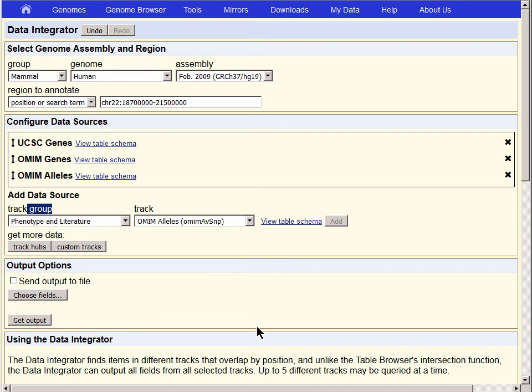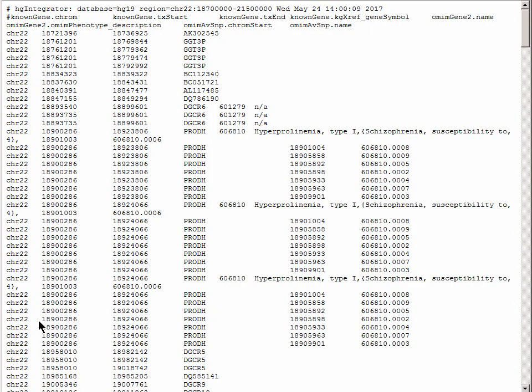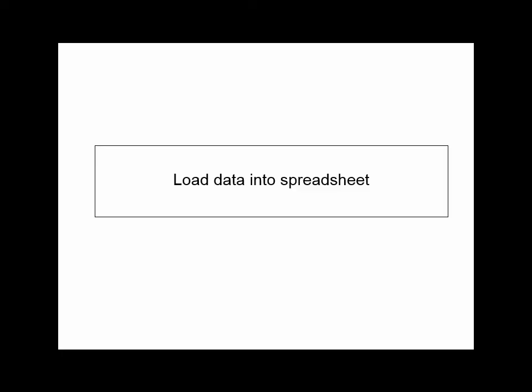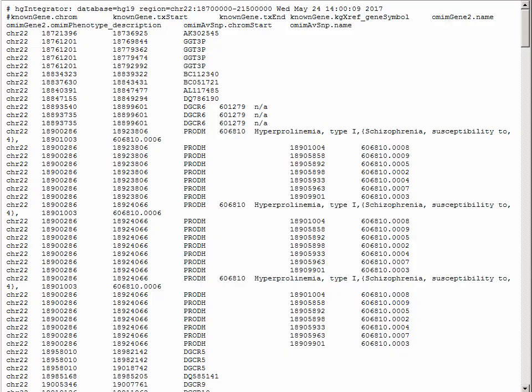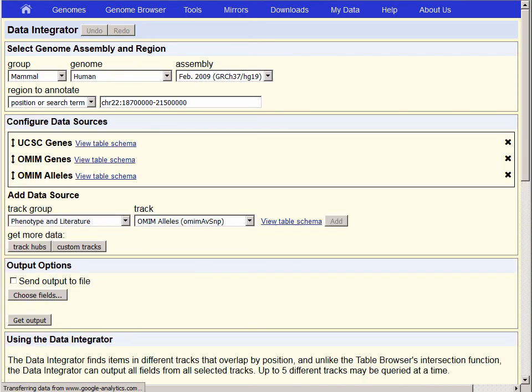If we simply Get Output and dump the data to the screen, which is suitable for porting it to programs or some kind of script if you want to mine the data, let's go back to the Data Integrator and load it directly into a spreadsheet by sending output into a file.